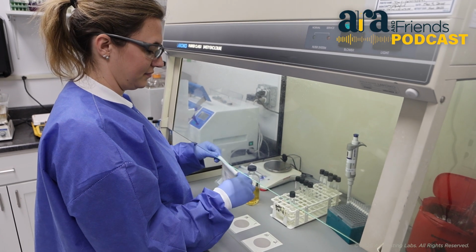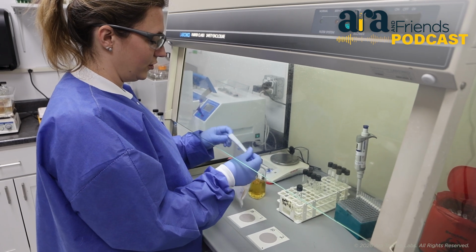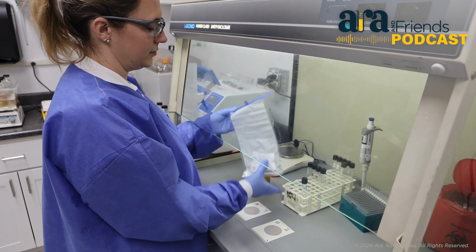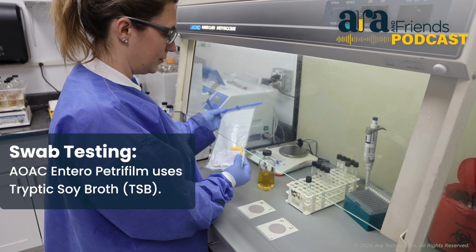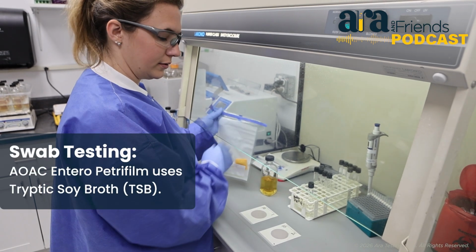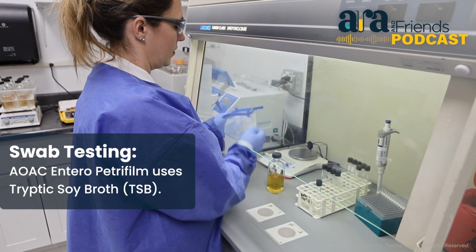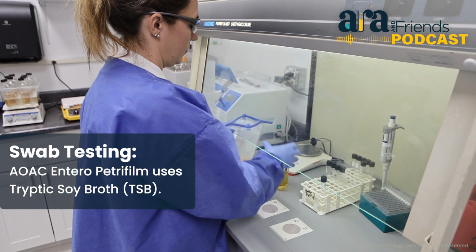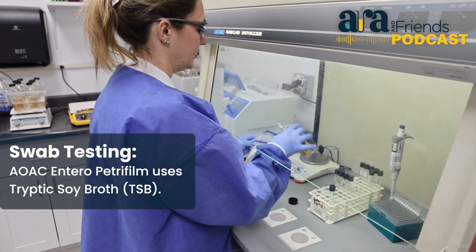Okay, we're back in the lab with Megan. Tell us what you're doing now, Megan. I have an environmental swab for my customers, a sponge swab down in here. And I'm going to pour my broth in, get it mixed in really well, and plate Entero Petrifilm again. And what's your broth? TSB.